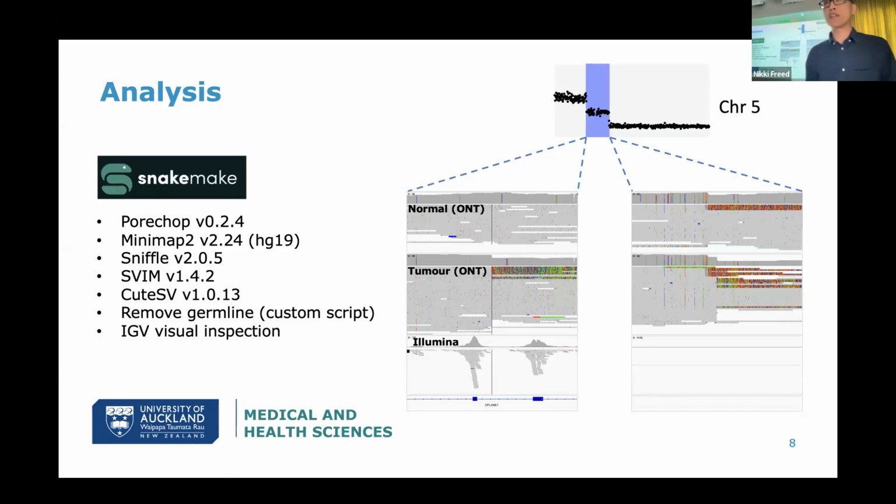Each gray bar is a read aligned to part of the human genome. If you see a lot of colored dots, that means there's a lot of mismatch. If you see a very consistent mismatch across a read, it means that part of the read is being mapped to a different part of the chromosome. This usually indicates there is a structural rearrangement of some sort.